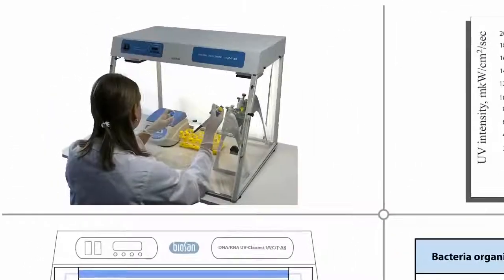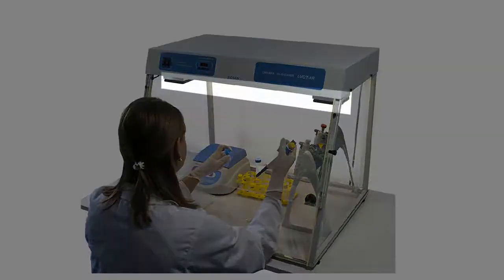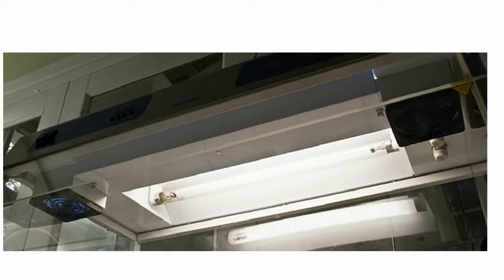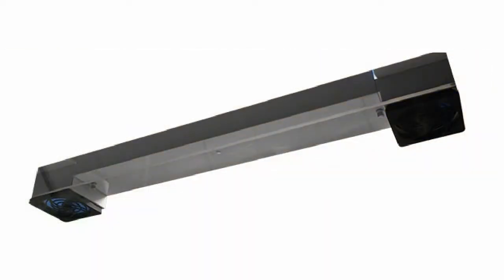UV Cabinets are equipped with a flow-type bactericidal UV clean recirculator. The recirculator consists of a fan, dust filters, and a UV lamp organized in a special aluminum casing, which protects users from direct UV light during operations.